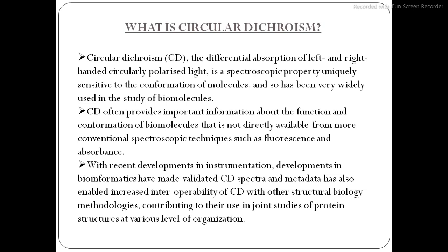With recent developments in instrumentation and in bioinformatics, validated circular dichroism spectra and metadata have also enabled increased interoperability of circular dichroism with other structural biology methodologies, contributing to their use in joint studies of protein structures at various levels of organization.